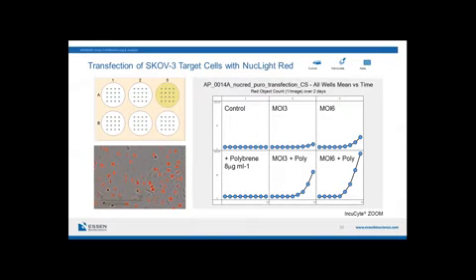we did a simple matrix experiment where we used a range of different MOIs in the absence and presence of polybrene. What you can see from this analysis in the right half of this slide is the optimal concentration was MOI 6 plus polybrene, and after 2 days we saw a high infection rate. The image on the bottom left-hand side shows that roughly 70 to 80% of these cells were expressing the nuclear-targeted RFP.